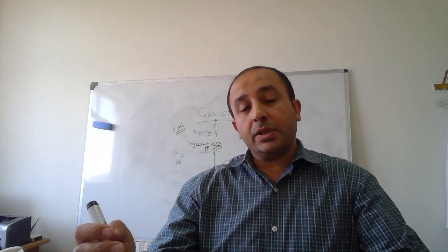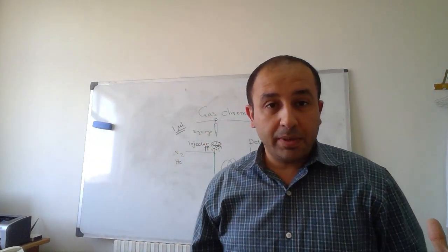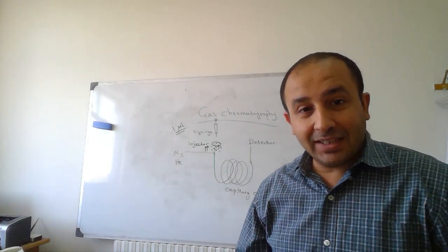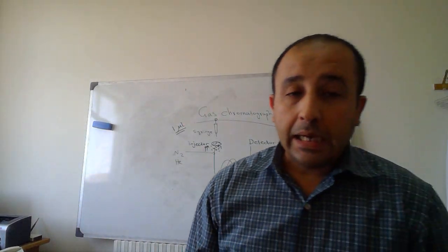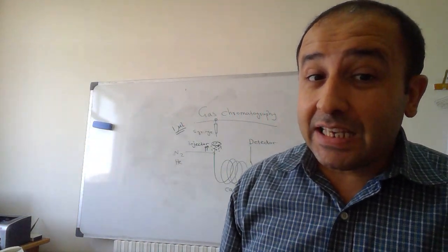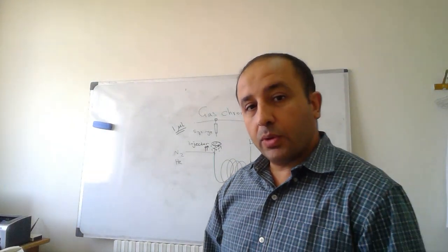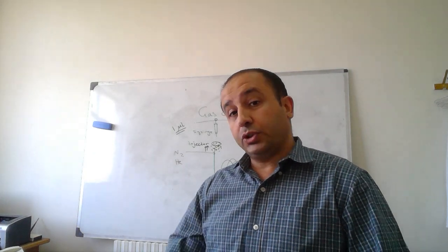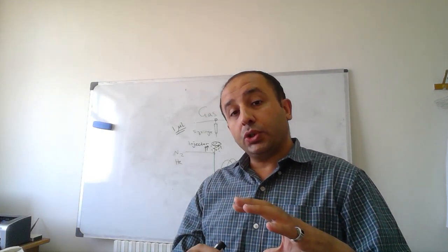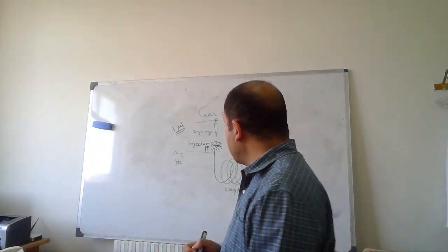More than 3 microliter, we will have a very big volume for the sample, and this cannot be contained in the limited space of the injector. And even if we push the system to have more than 3 microliter of the solution, we would have a large volume in gaseous phase.